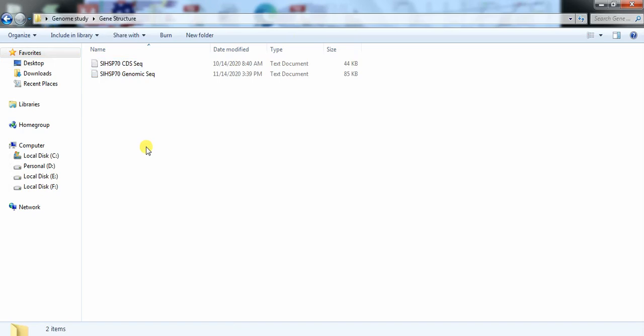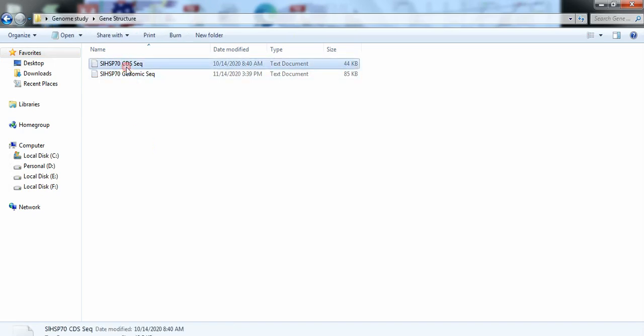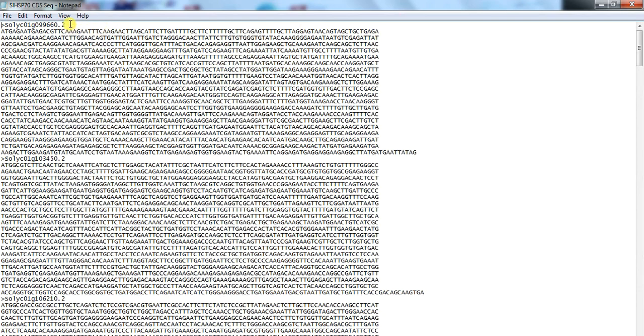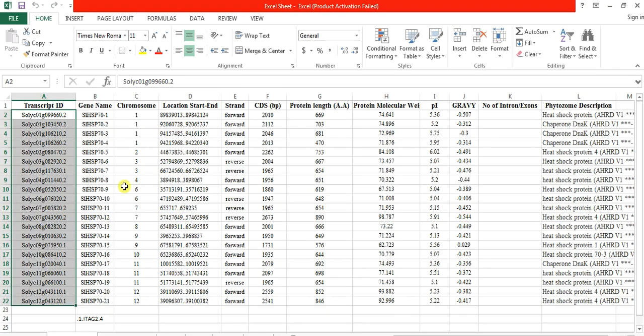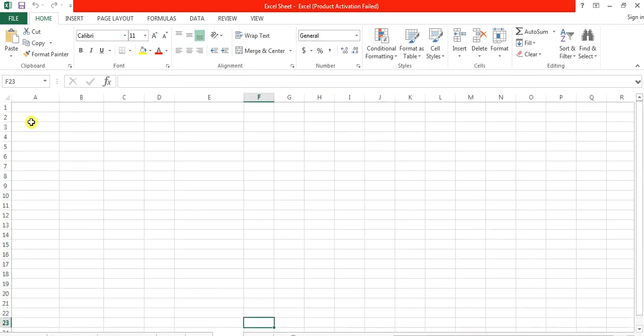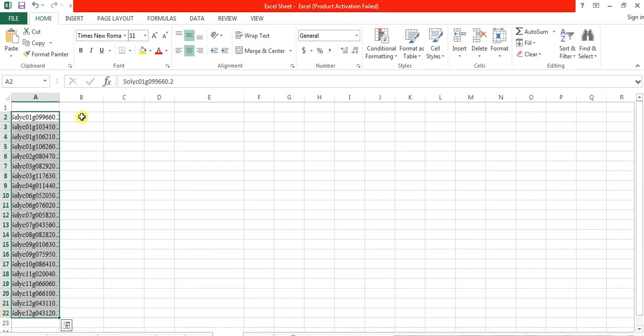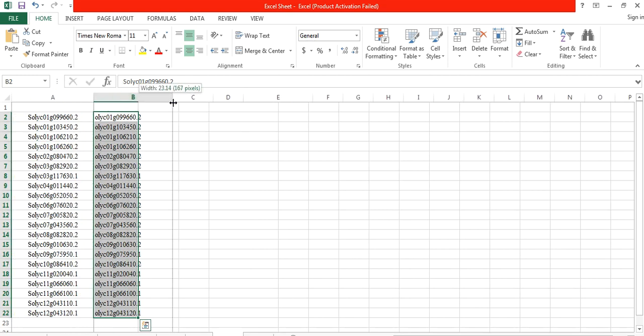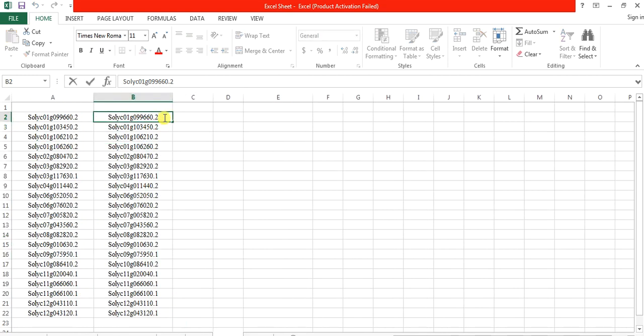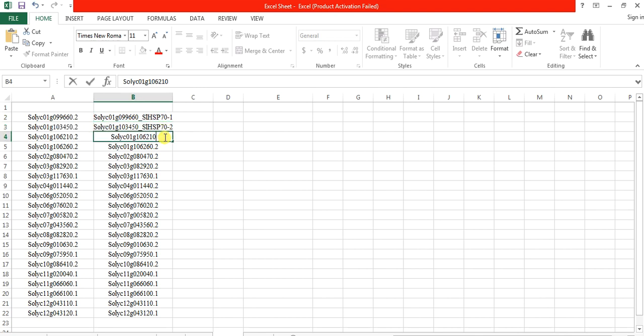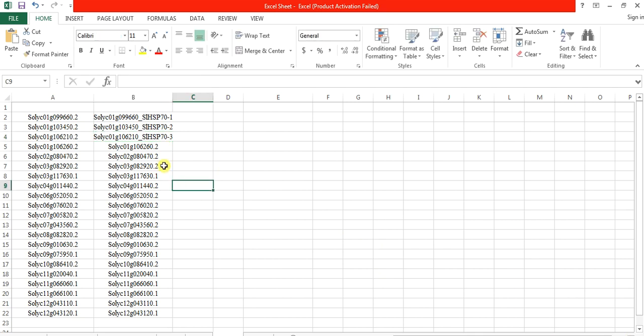Now we need to change the name of this transcript into transcript as well as the gene name. We will do it to make the reader easy to understand. For that, open the excel sheet, copy this transcript and paste it in one and also in another column. Now change this name into transcript as well as the name of this one, and also change all the names like this way.